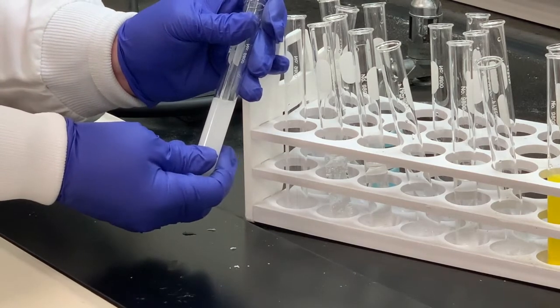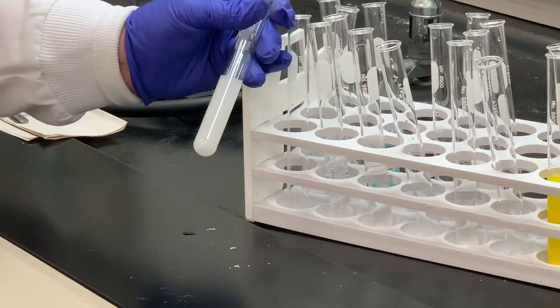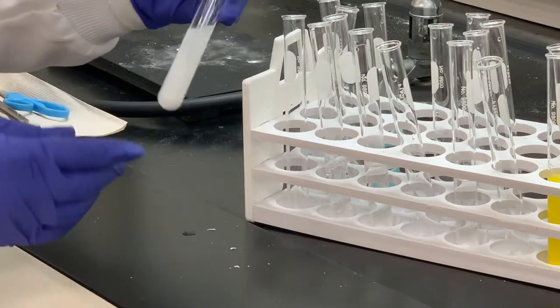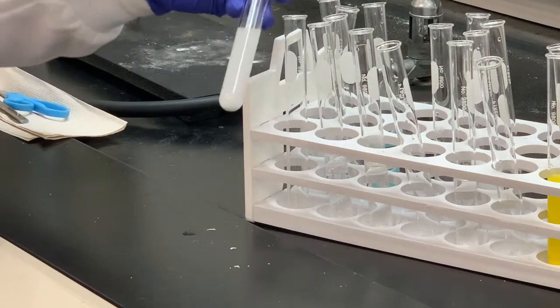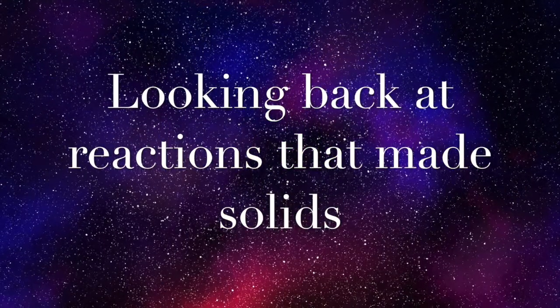I don't notice a temperature change. I don't see any bubbles rising to the surface. It may look more cloudy than actual solid, but if there is some solid, when I stir this, you can certainly see the solid moving around there. So did a reaction occur? We would say yes.